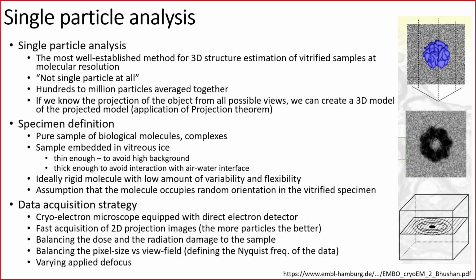Although it's called single particle analysis, it's not using a single particle. It's using many more particles. So sometimes this term for newcomers is a bit misleading. The single particle means that we are selecting single particles from our micrograph, and these particles are then used for the reconstruction process.